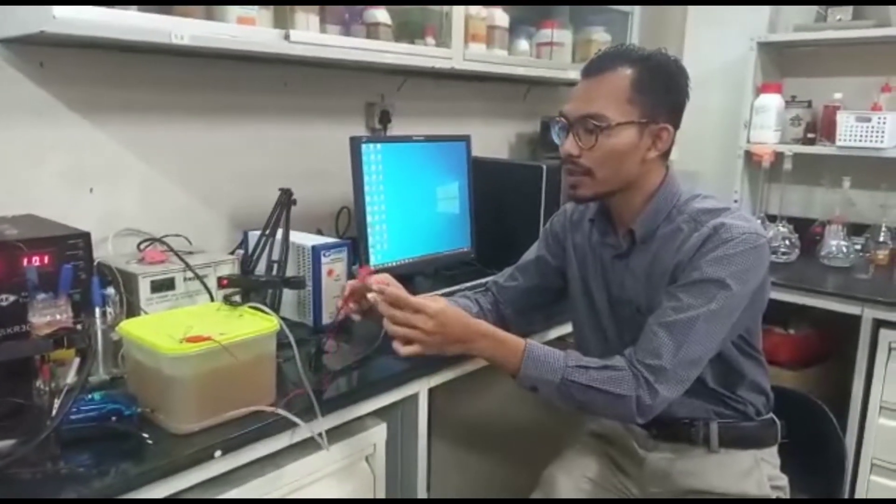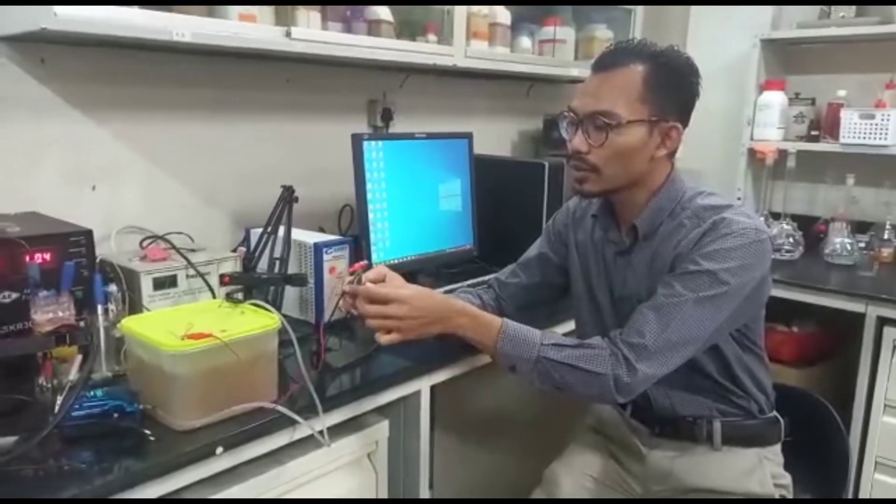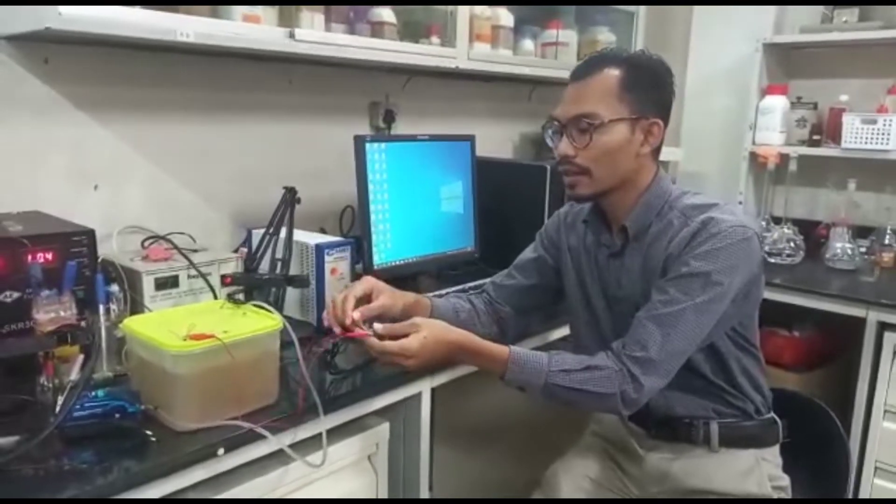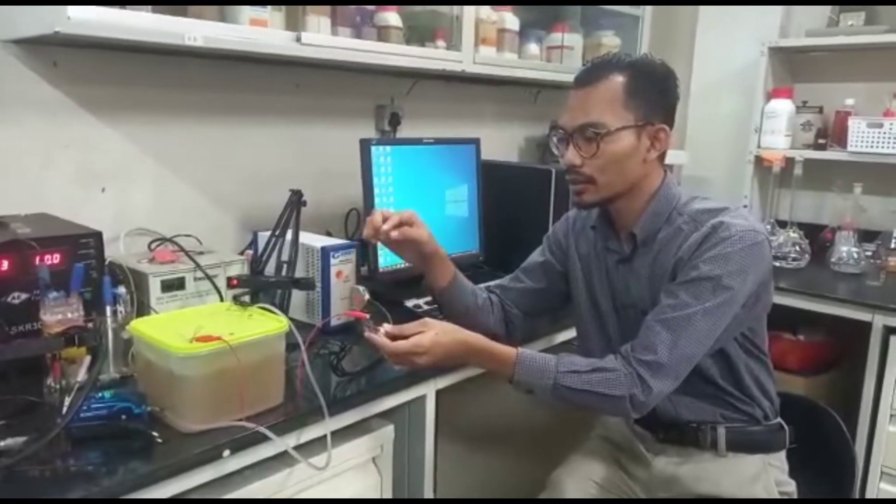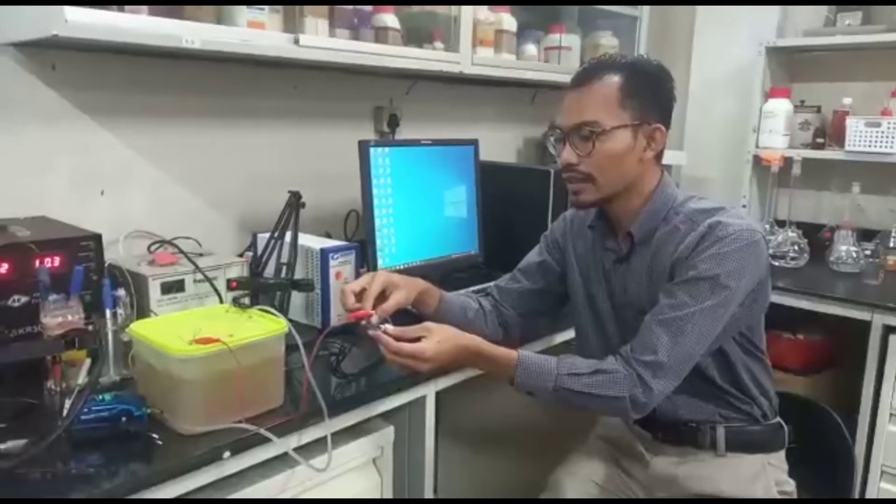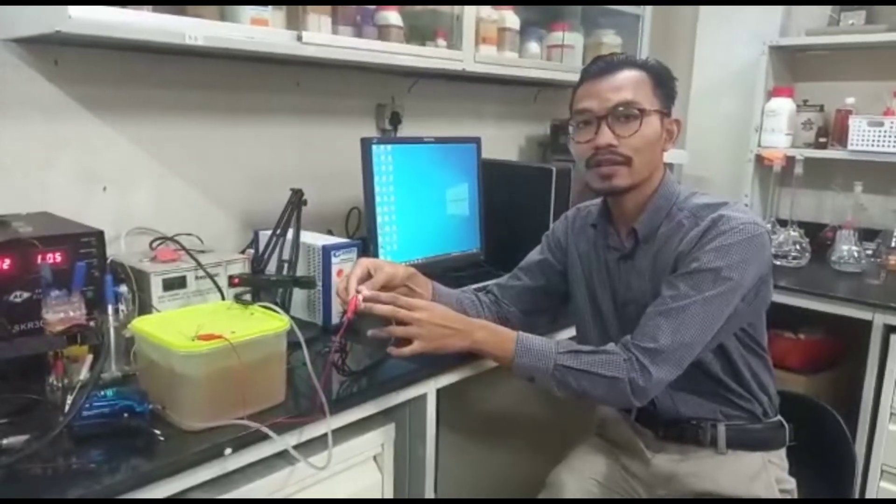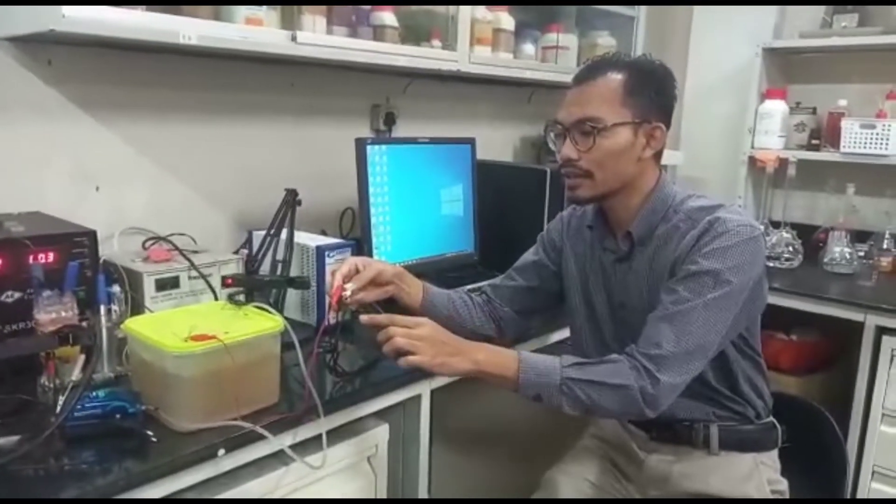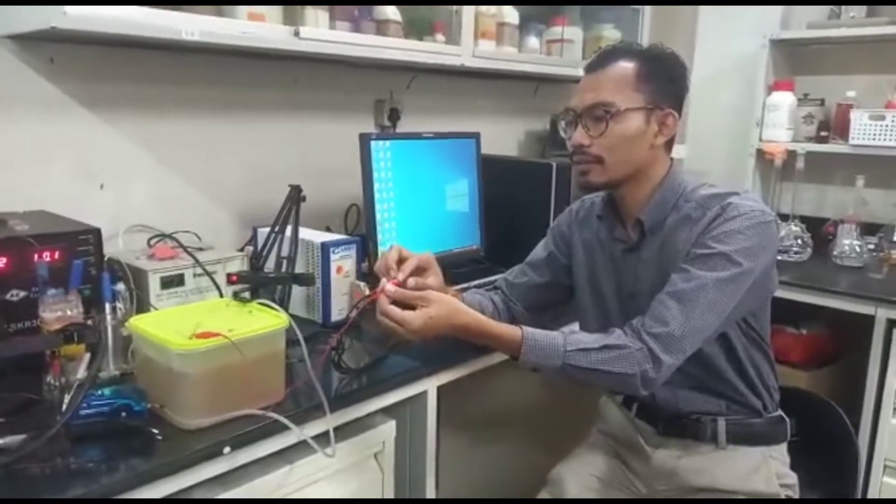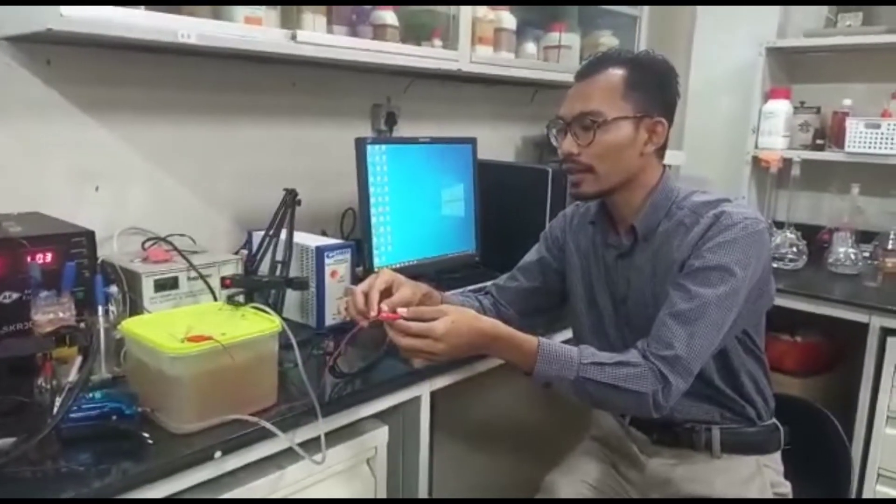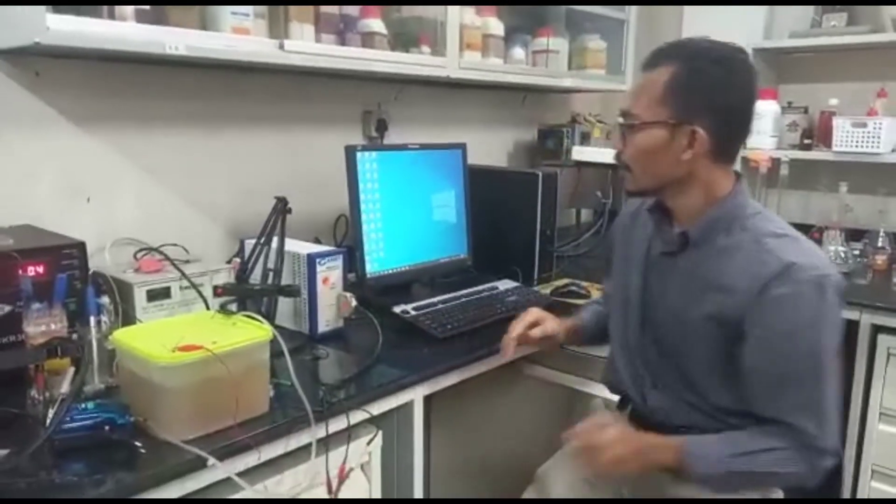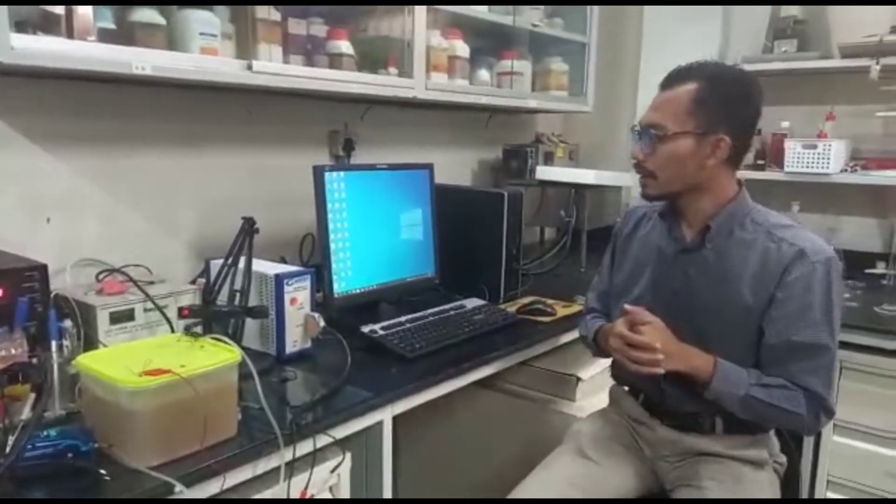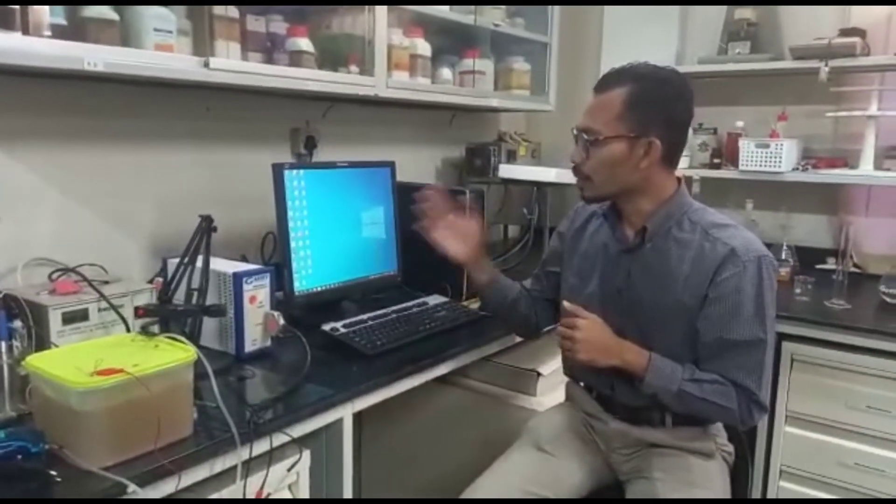And another setup will be the electrode is clipped together with your counter electrode, counter reference, and also reference. So all these are actually short circuited together and clipped to your another terminal electrode.